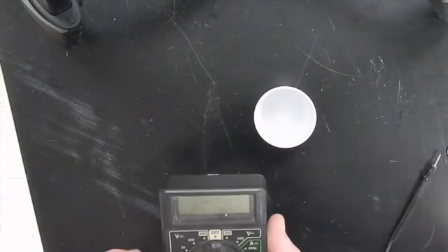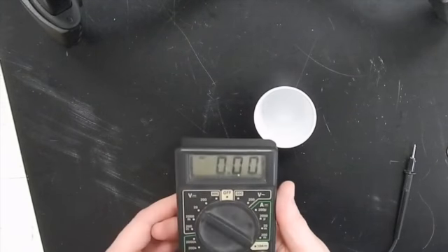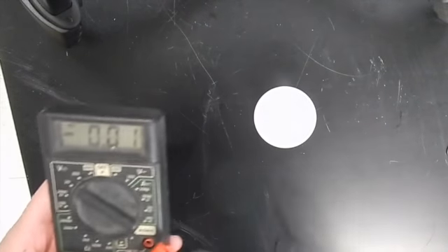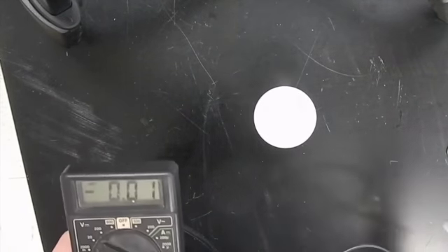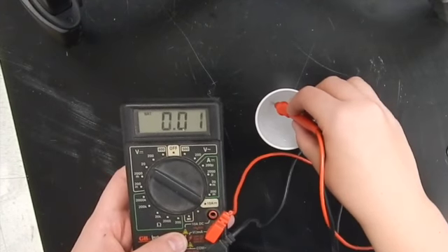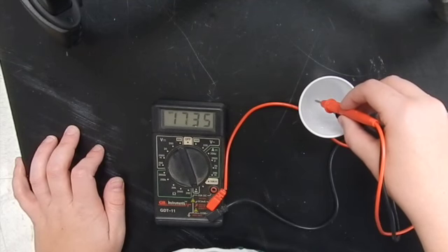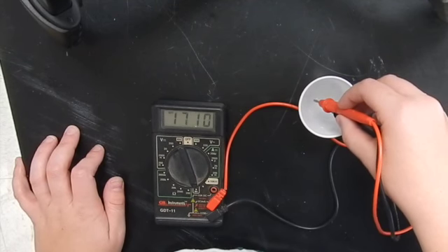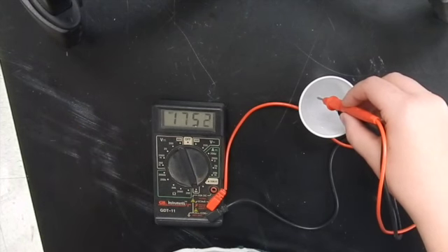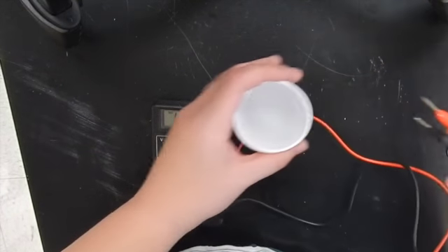We are going to turn this on. We'll do 20. So we're going to put both ends into the liquid and see what number it changes to. Around 165, 17, so around the 1700s. Okay.